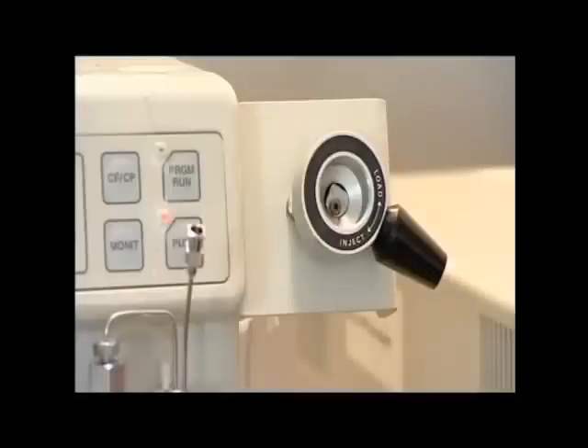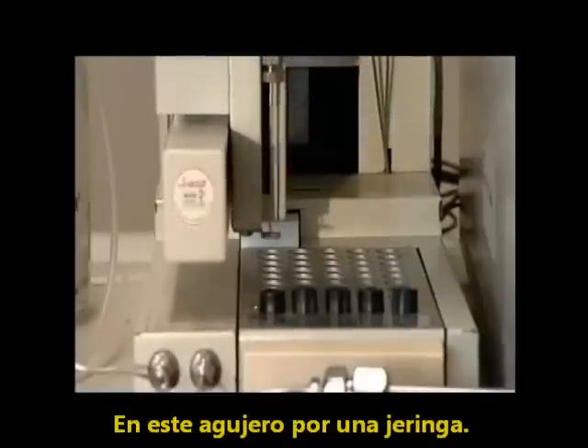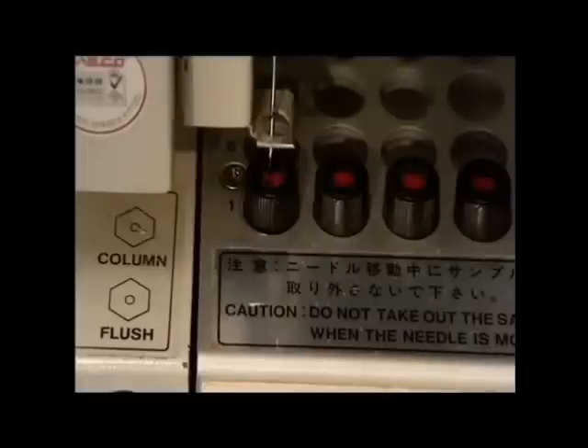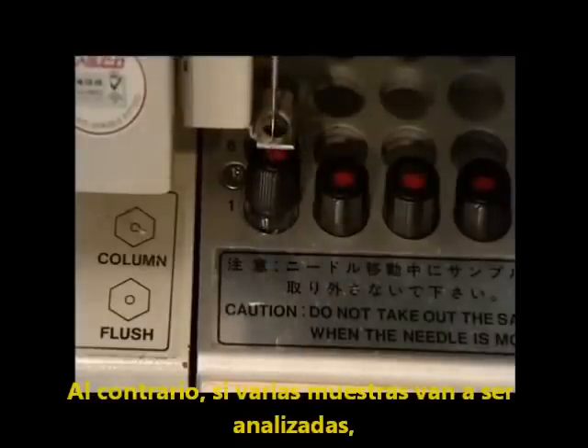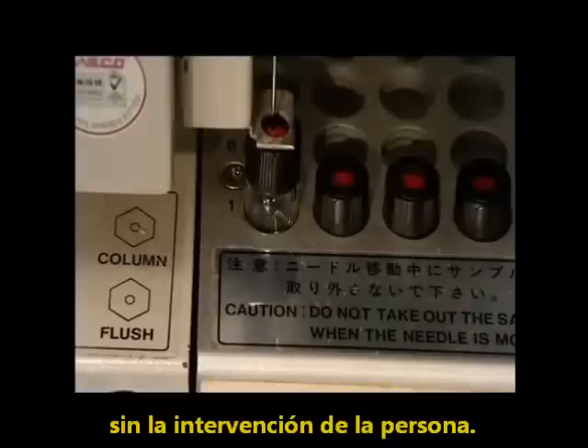If a single sample is to be run, it is injected into the solvent stream here, in the injection port, via a hypodermic syringe. Alternatively, several samples can be run in succession by loading them into this auto-sampler, which will run them in order without any human intervention.